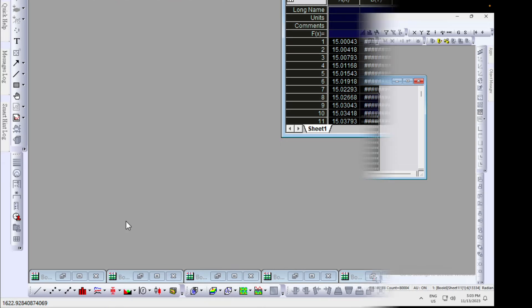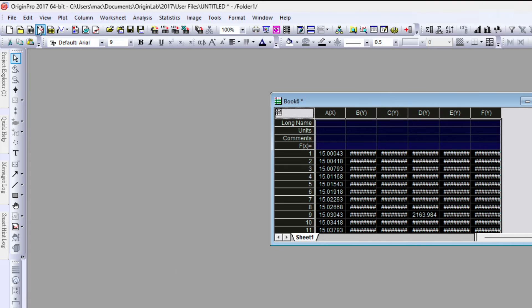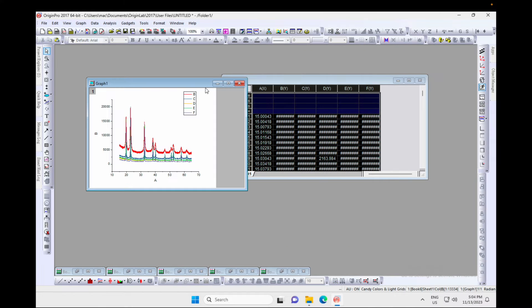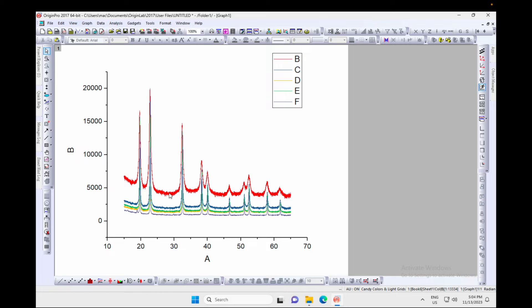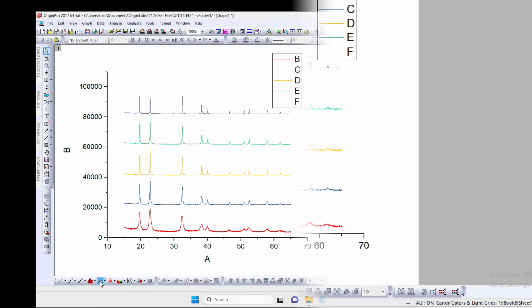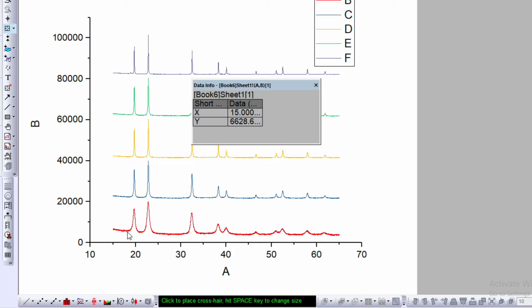Now select all the columns. You can go to the bottom left corner or use the Plot menu and select 'Line Plot'. Click on Line Plot and you'll see a graph where all the XRD data is plotted, but they're overlapping. In the bottom left corner there's also an option for 'Stacked Line by Y Offset' — click it to stack the lines vertically.